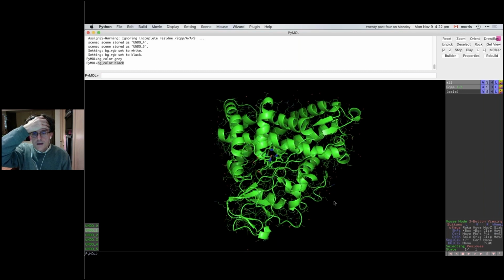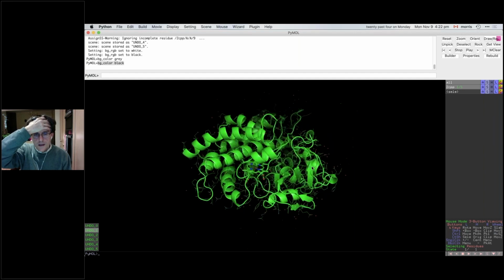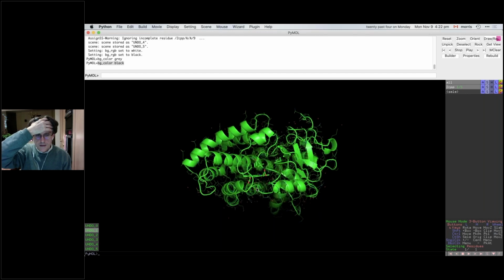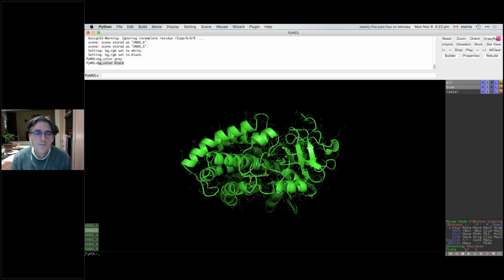We can see blue atoms; those are nitrogens. You can see some in the center there, in the tetrapyrrole of the heme. I'm looking there edge on. You can see the red oxygens of the propionate groups of the heme. We can also see in the middle there the camphor.